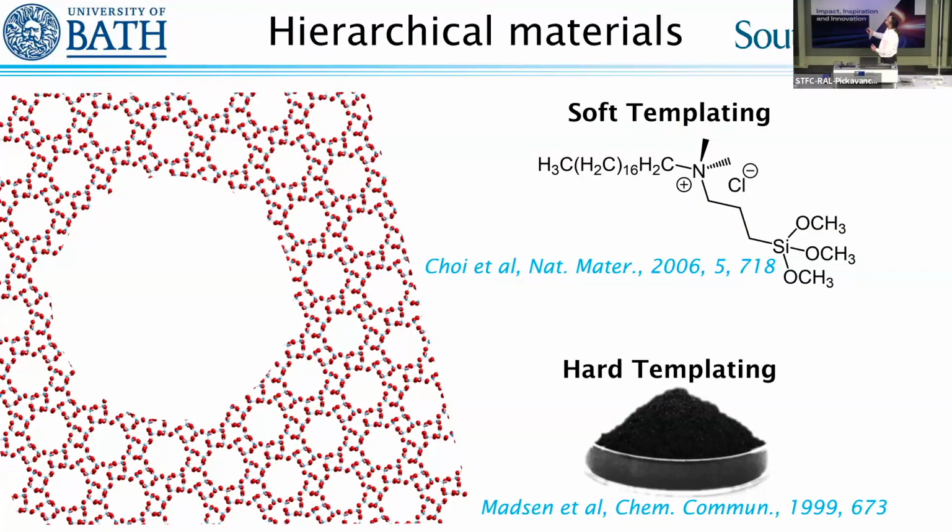This is a very similar system. You can see there's a very long, bulky organic group here, but also importantly, there's a silica head group. And this we'll come on to later as to why it's important. I'm not claiming to have pioneered this technology, by the way. This was done in 2006. I am simply jumping on a bandwagon a little bit too late.